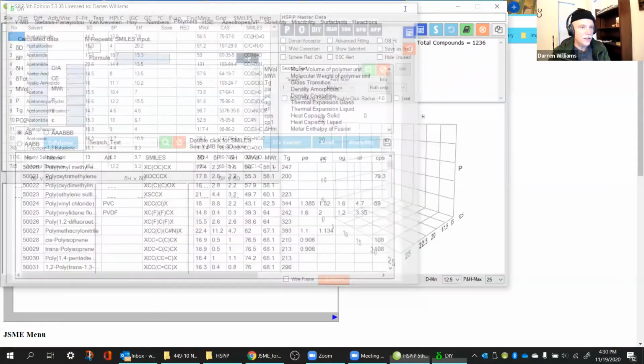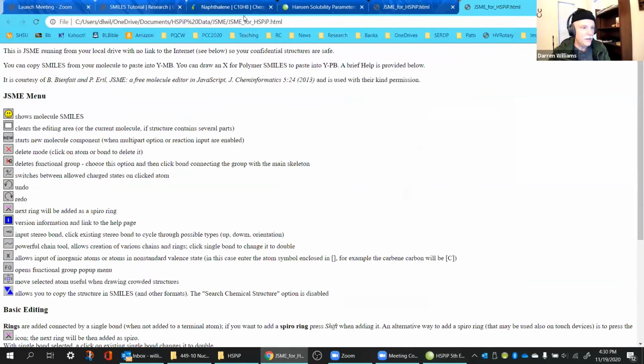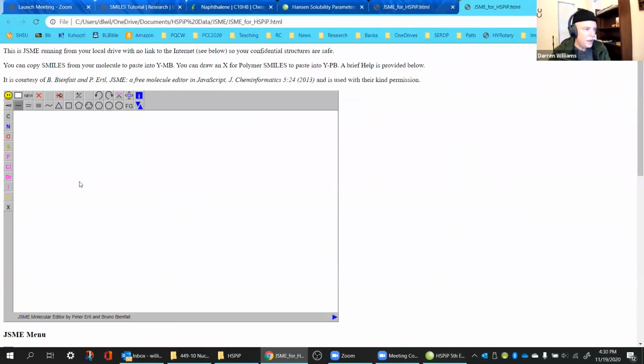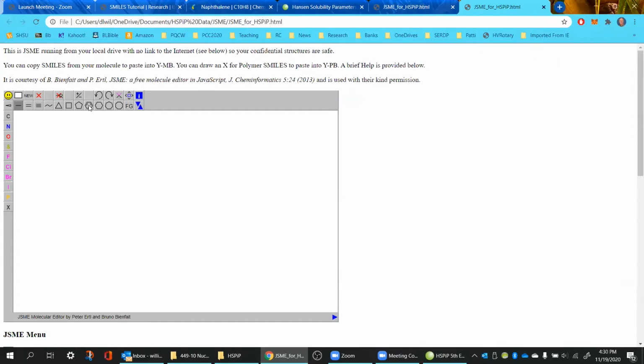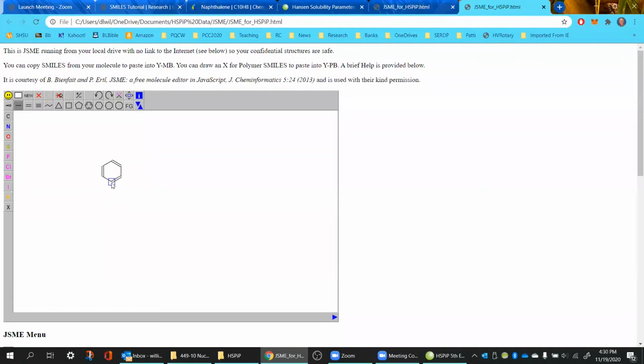Let's close this. Let's make a polymer, okay? So we come back up here to the SMILES thing. And what kind of polymer do you want to make? Polystyrene. Oh yeah, the good old polystyrene. All right, let's go polystyrene. The one Dr. Hobbs always uses as an example. So the one that we know by heart. All right, very good.